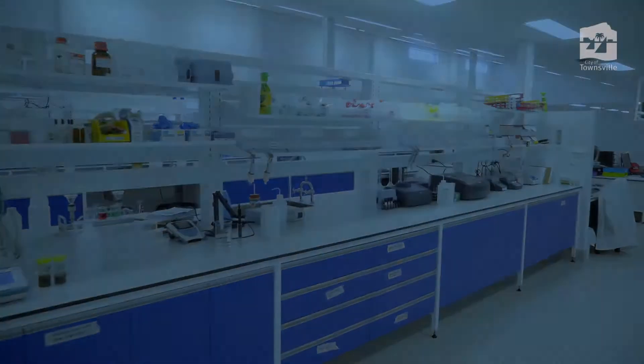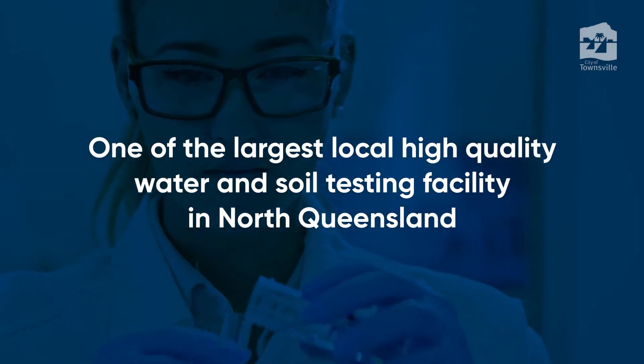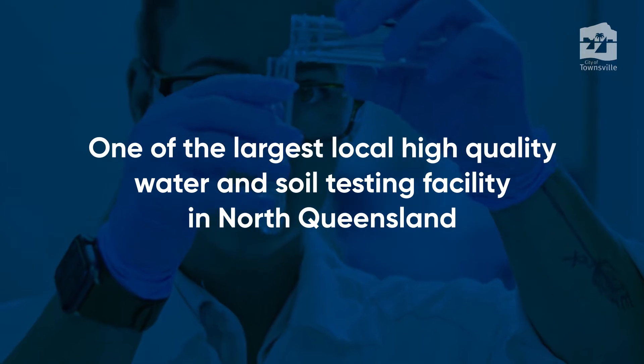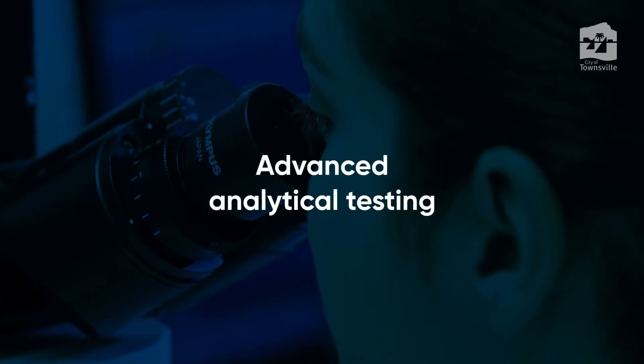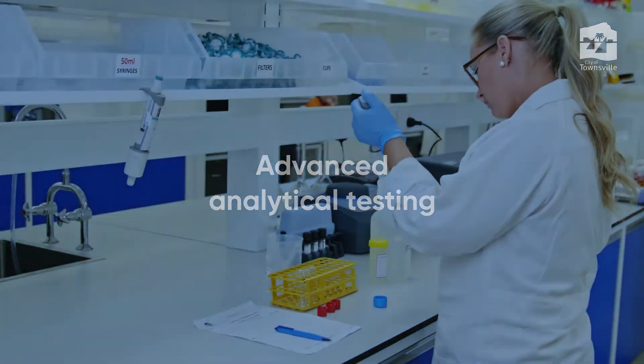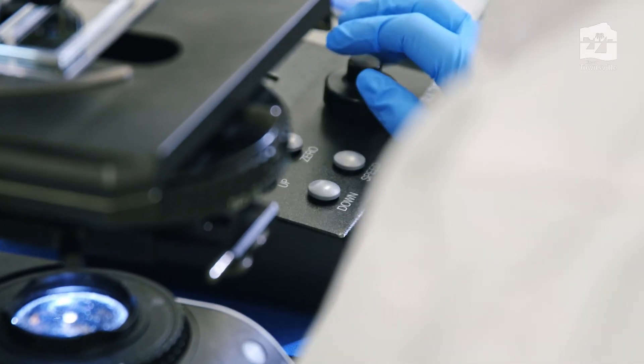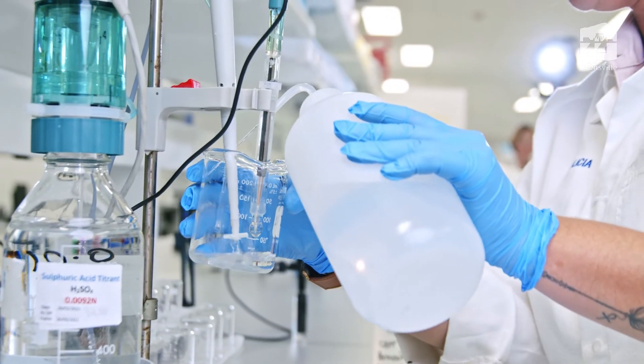Townsville Laboratory Services is the largest local high-quality water and soil testing facility in North Queensland. Lab services provide advanced analytical testing to a range of industries, from local government to hospitals, schools and other institutions in the region.